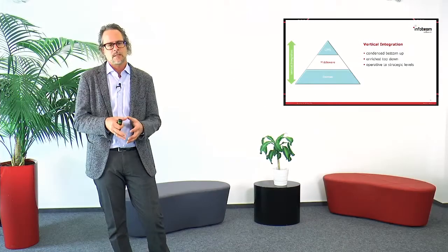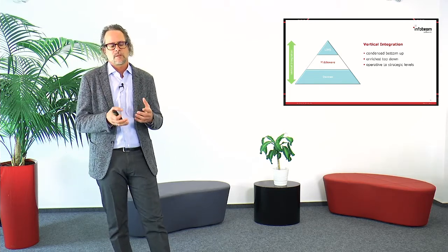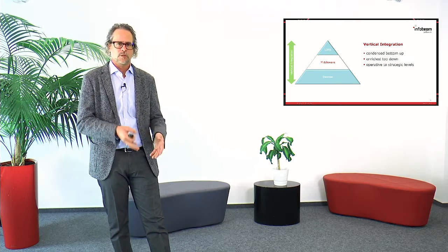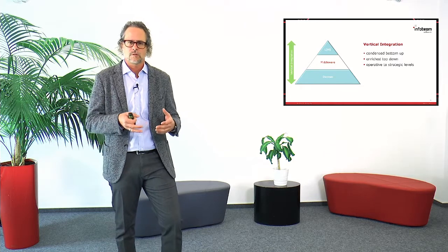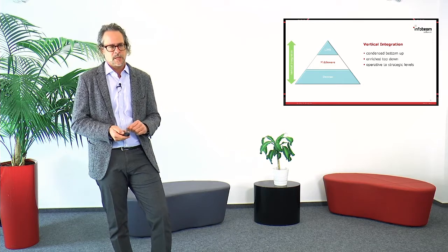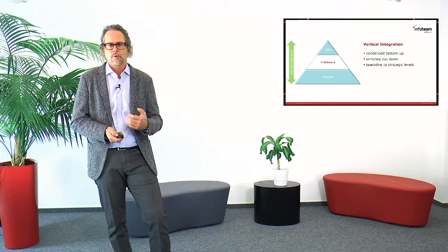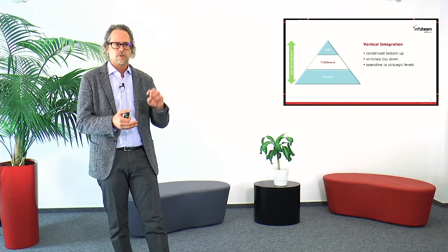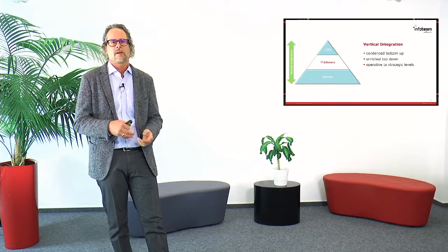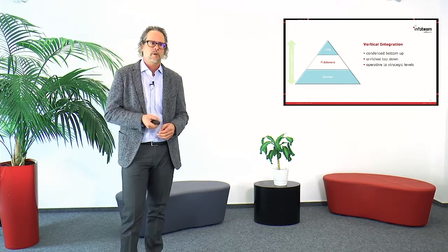But we condense data. And vice versa, we enrich data when it travels from top to down, because the order ID of a test that a LIMS might know has to be enriched for the instrument to know what exact diagnostic test it will have to run with which parameters. That just works if we have enough trust in those standards and in those data transporting mechanisms, that we know that if we have just a condensed set of data at the top, we're always able to dig deeper and find out what the surrounding parameters at that point in time for that experiment were. That's what we call vertical integration.